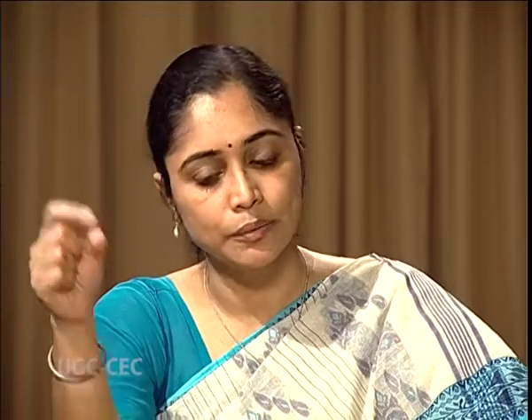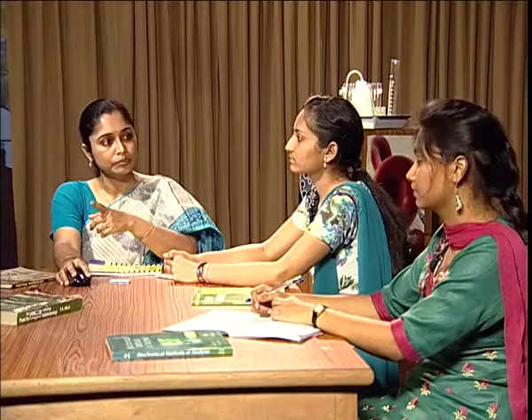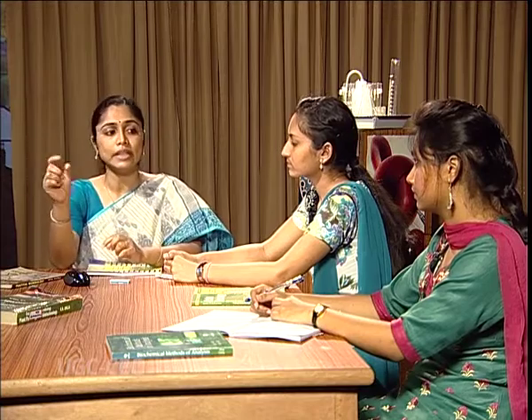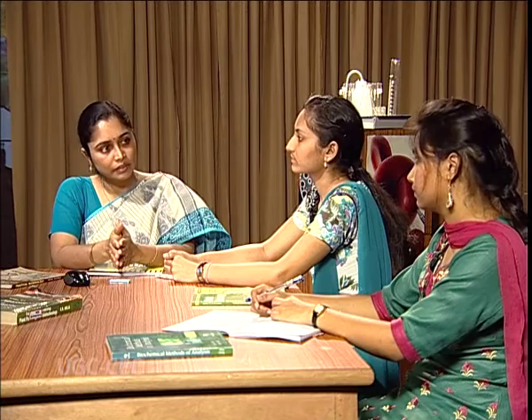Here the second antibody is generated against a second epitope of the same antigen. Now, if the sample is carrying the antigen, then the sandwich will be formed, and upon the addition of the substrate it will change its color, and we can see whether the antigen is present in the sample or not. And quantitatively we can detect the presence of the antigen by measuring the intensity in an ELISA reader.